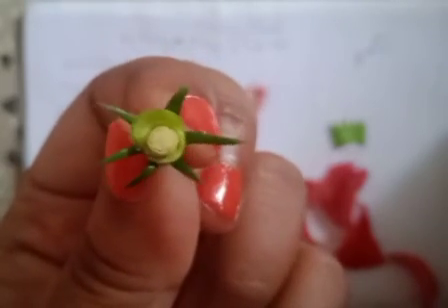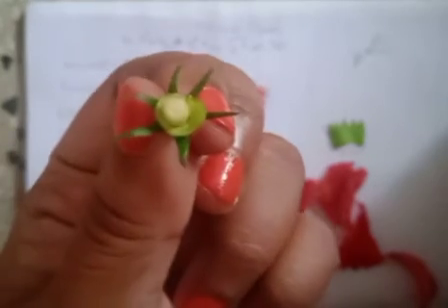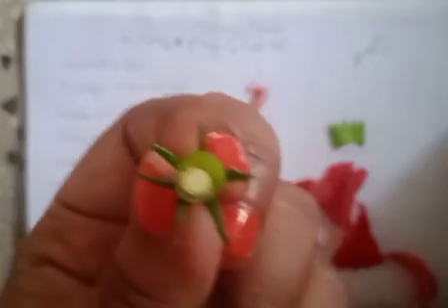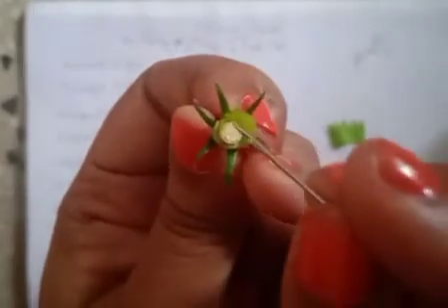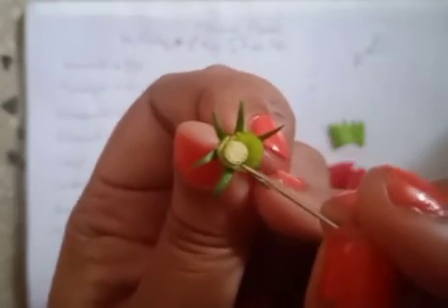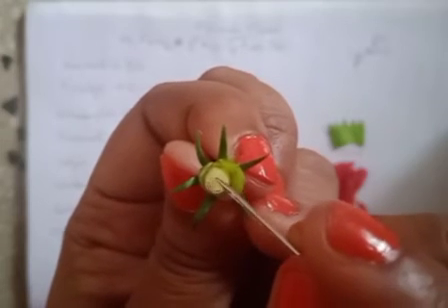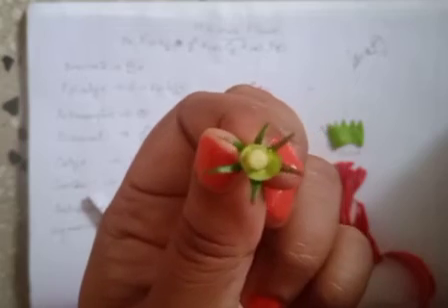It's kind of visible, right? So you see there is a symmetric form of ovary. So you see here we have one, two, three, four, five lobes.